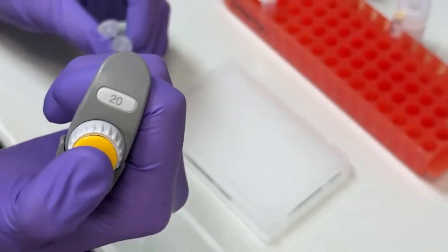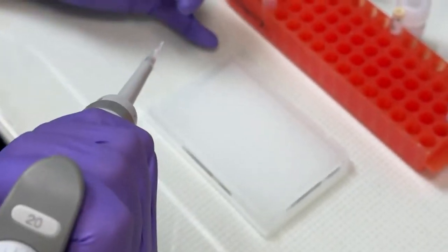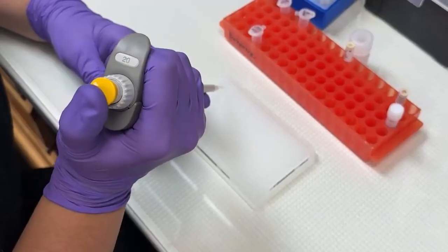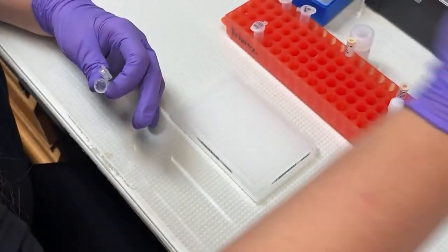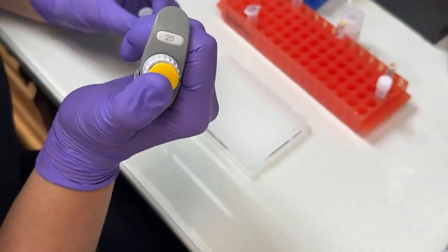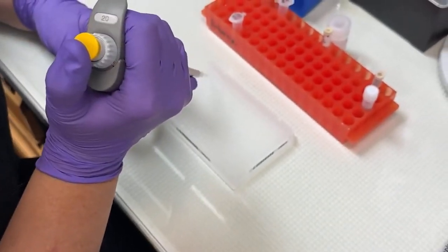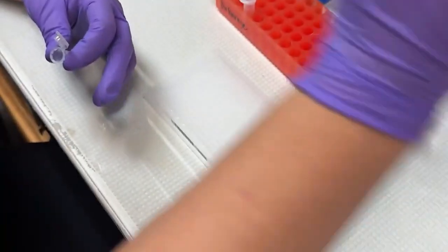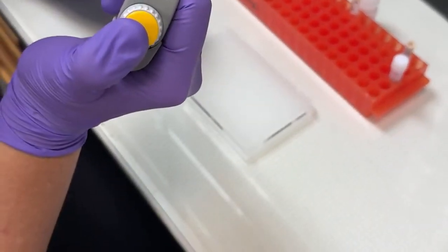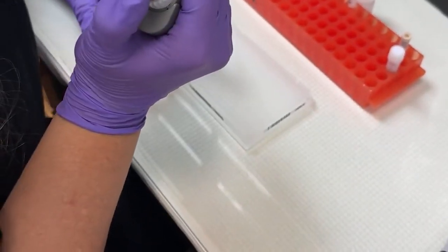And when this is all put in, in row A, I will put sample 1. In row C, I will put sample 2. In row E, I will put sample 3. And in G, I will put our no template control.